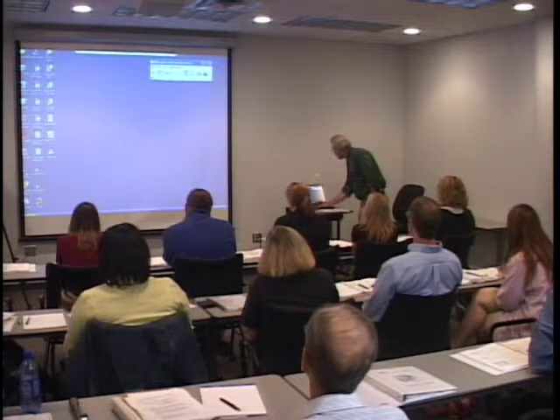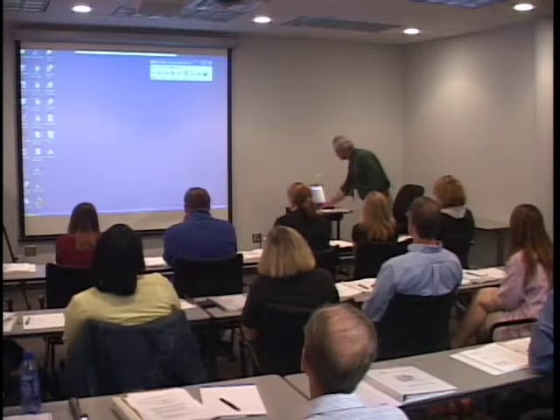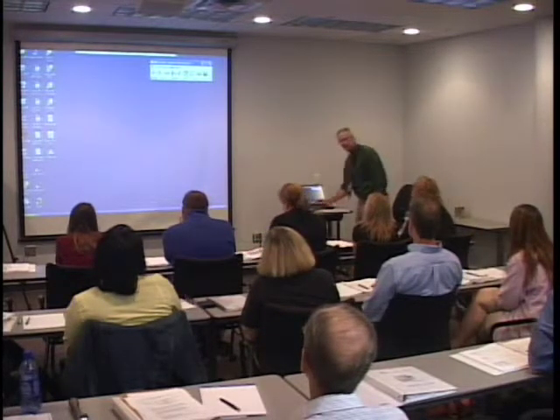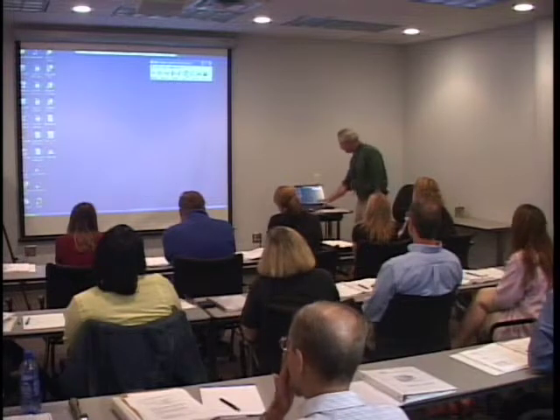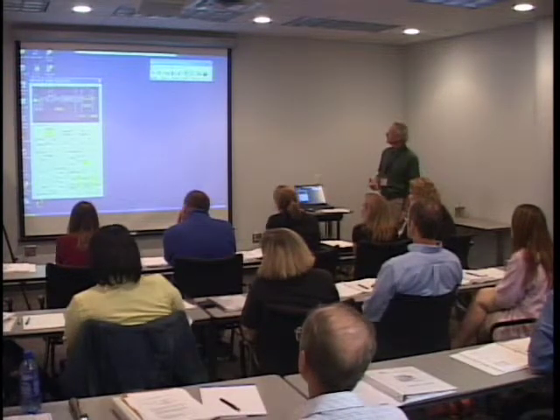We turn the DART on and click this and you'll see everything will be running. If you want to know what's actually happening, this piece of paper here is the parameter page. That's an unfortunate choice of icons because it's right next to another piece of paper icon, which is the error message thing. But this one just gives you an overview of what the DART's doing.